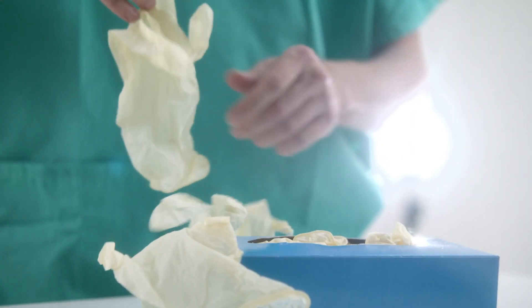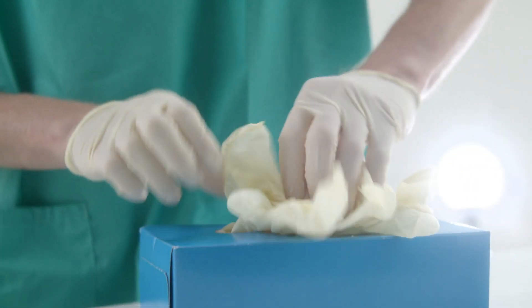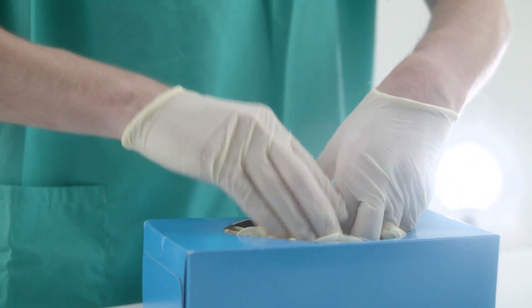10% of gloves pulled from a traditional box can be wasted as they drop to the floor or work surfaces. Some even get pushed back in. Demonstrated here under ultraviolet light, bacteria can spread within the box.